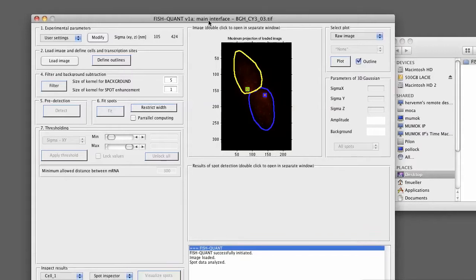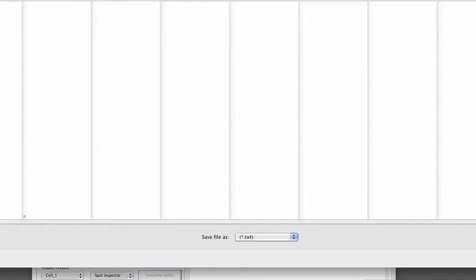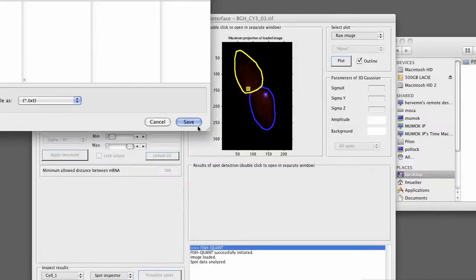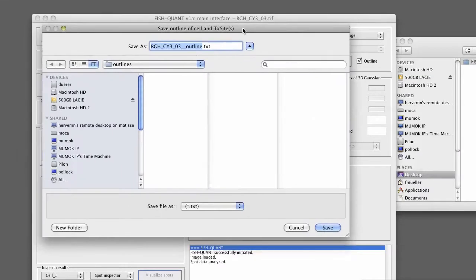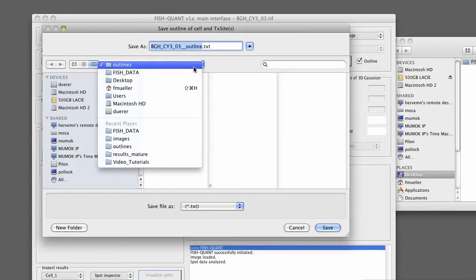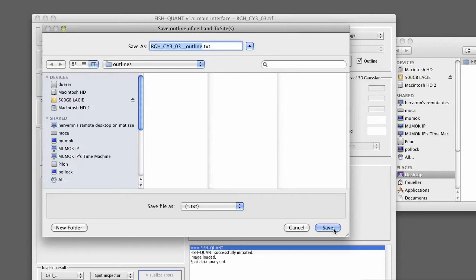We can now save this outline. This is from the FishQuant menu that you can unfortunately not see in the screen recording. But you go in the menu to FishQuant Main. There you have the submenu Save. And there you have the option Outline of Cells. This will open a new interface. It will be automatically in the outline subfolder that we defined. It takes the name of the image, underscore underscore outline dot text. This is a simple text file that contains all the information that we specified, the experimental parameters, and also the position of the cells and the associated transcription sites. So we can simply press on save.